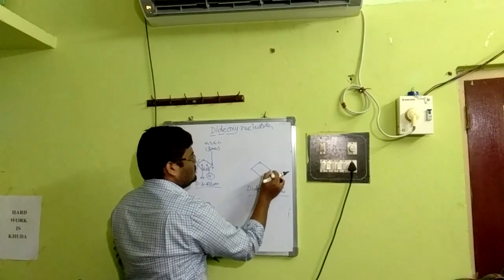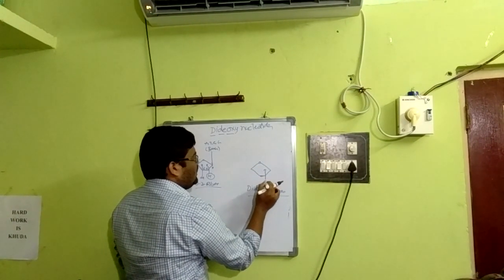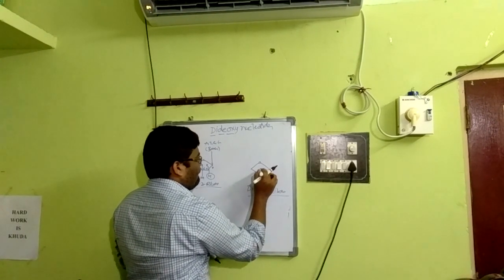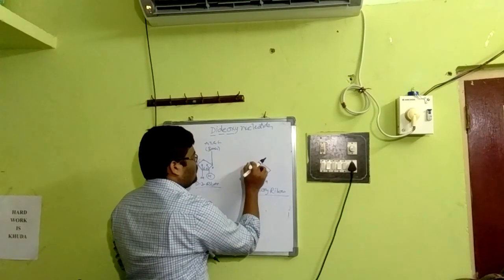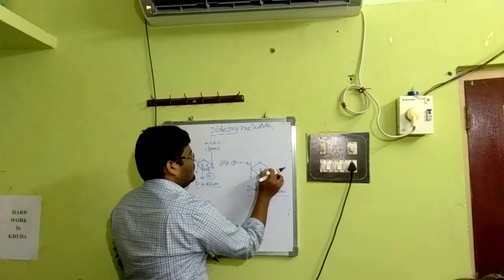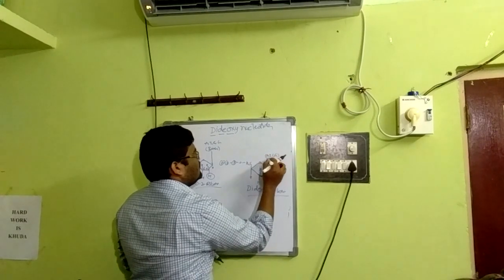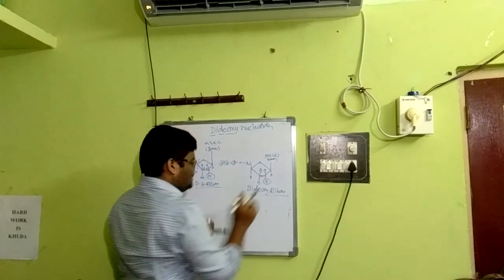Say this is a ribose. At the second position, this is the usual H, and at the third position also, there will be no hydroxyl group. This is very important. These are the bases, say A, T, C, G. Just see the distinction.